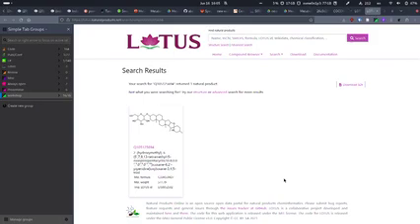MassBank. It also accepts MGF files, so you could also import GNPS, for example, this way. That would be the way how you import your custom database basically over this tab. So we don't make a difference internally between structure databases and spectral databases.